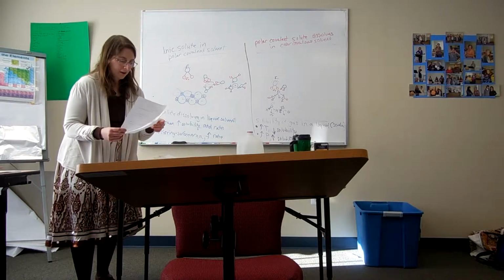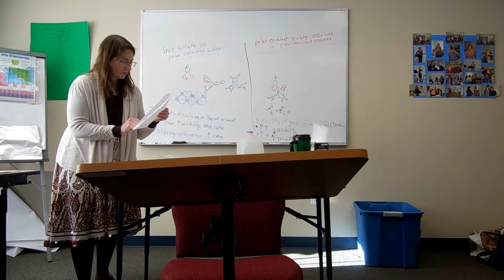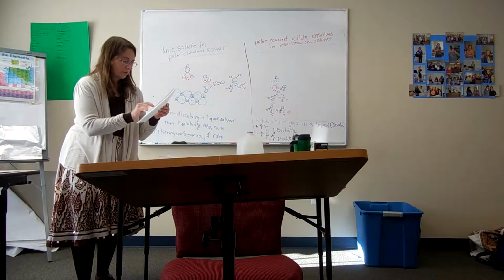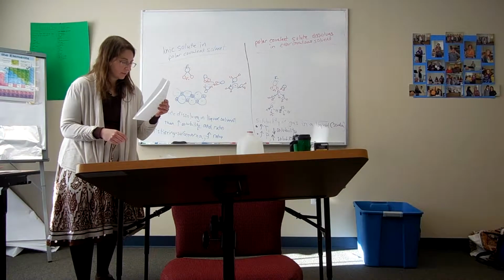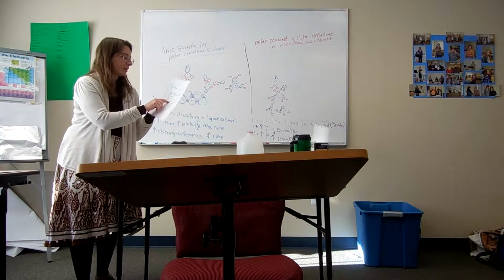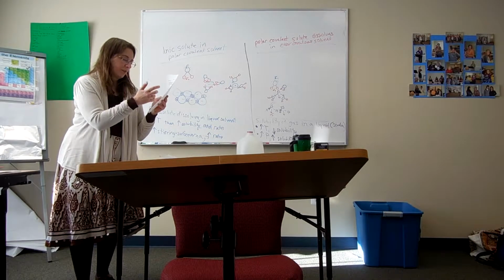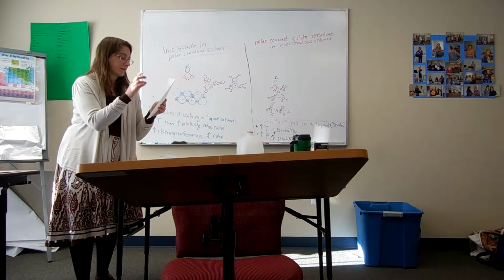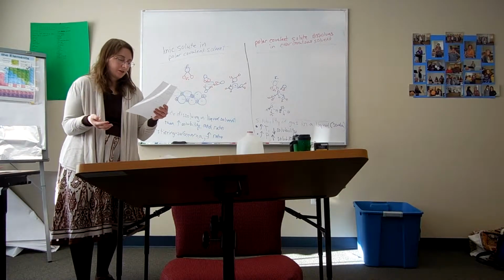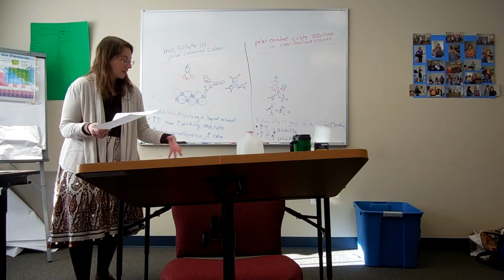Calcium hydroxide. Strong acids and strong bases are soluble. So here's a list of strong bases. Calcium hydroxide is not on my list. So we move on. Insoluble compounds, rule 7. All hydroxides are insoluble except alkali metals, row 1A, barium and strontium. Calcium hydroxide is slightly soluble. So, calcium hydroxide, it depends on the concentration if it's going to stay dissolved or not. So then we'll just have to observe.